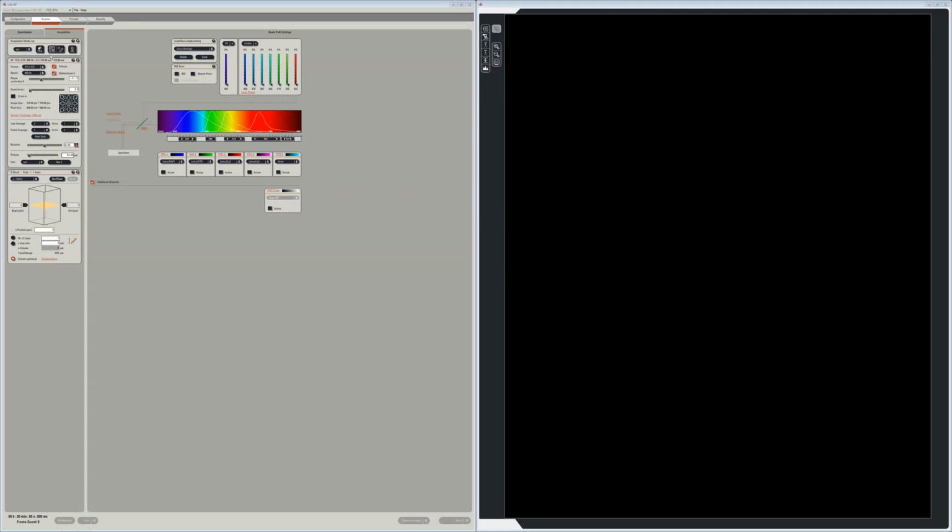To create a sequential scan, once you have more than one fluorophore, you just come up here and you click sequence, and it will show you here scan 1. For most experiments, we're going to use between lines. I will show you later what it is to do it between frames and why you should do between frames for some experiments. But for the general user, we're going to have between lines.